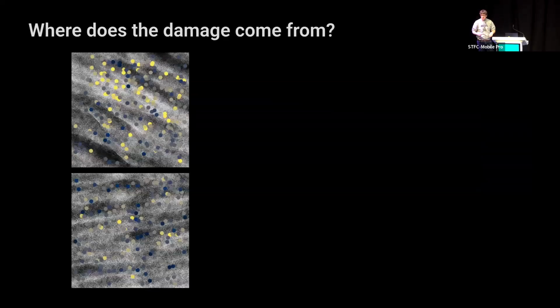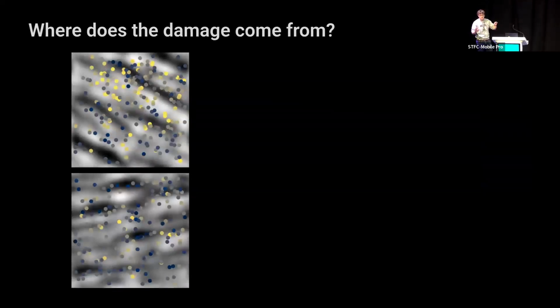And then we spent a lot of time just staring at the plots of the detections on the micrographs to figure out whether we can see a pattern, like where in that image do we get detections or not. The first thing we did is we bandpass filtered the images to see these crevices very well. And then every one of us immediately had an idea. It was like, oh, they're like strings in the dark areas. And somebody else said, oh, they form strings in the light areas. And we were really confused.